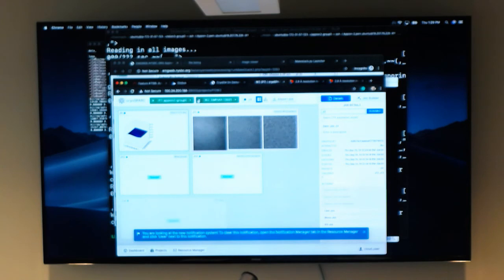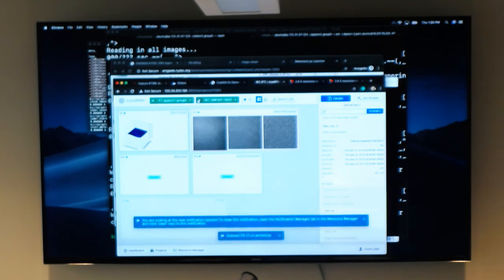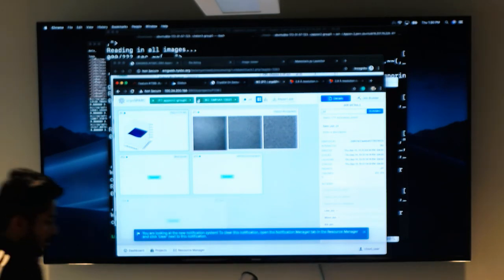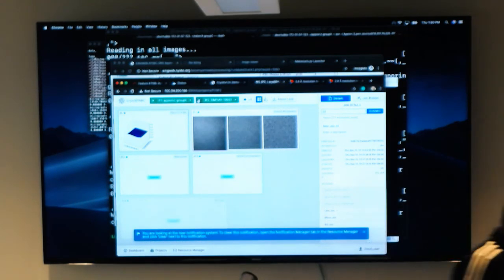It was auto-calculated by fitting that line, and if the slope is 82, okay, I see. So people use anywhere from 50s and 100s, which are really good, and thousands are absurd, which means you converge too quickly. Well, then is there something wrong? That means your data set doesn't have much similarity. And if there's more and more heterogeneity, you'll probably see that.